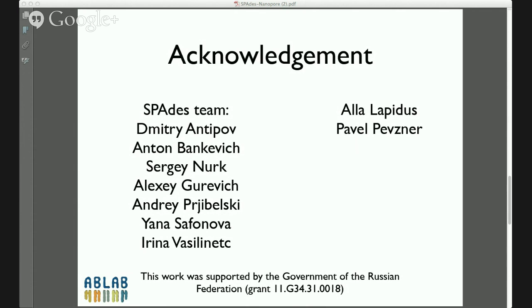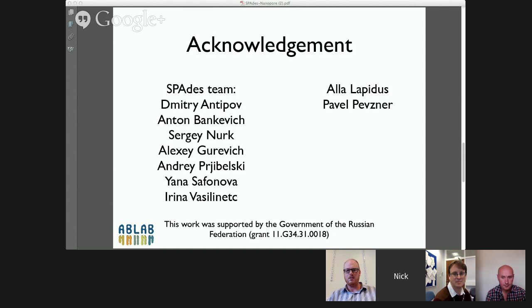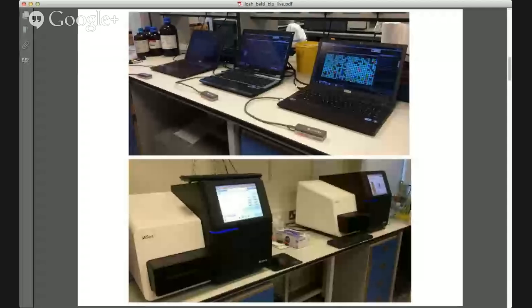It can sequence 16 bacterial strains such as Salmonella in 6 hours. So we received these samples at lunchtime. I did the library prep, and we ran the instrument overnight, and then we had the data analysed for an infection control meeting at 9 AM the next morning. So we were able, from that MiSeq data, to understand that we did have an outbreak.